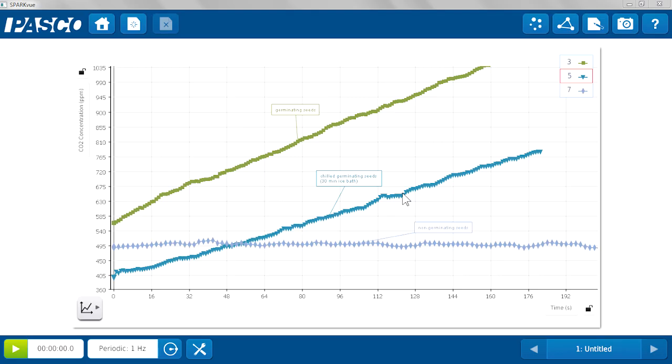You can then send the students into further exploration looking at the effect of temperature on cellular respiration. So the other run of data that I have here you can compare the green to the blue and that's a comparison of germinating seeds at room temperature to germinating seeds that were soaked in an ice bath.